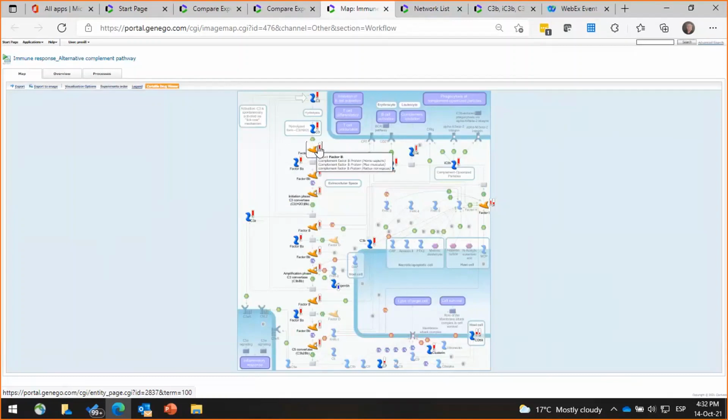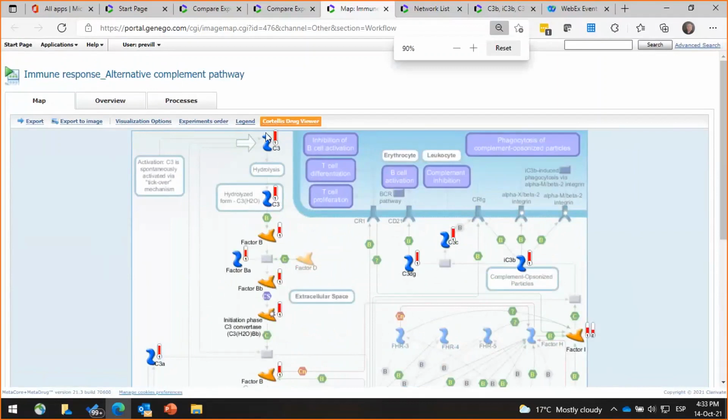And look at this. In these thermometer symbols are the differentially expressed genes being highlighted for us. Red is overexpressed and blue is underexpressed. And look at this cascade down here. Every single gene overexpressed in that cascade. We also have additional ones over here, and they all lead through. So the way to interpret these maps is you start from these big in arrows.